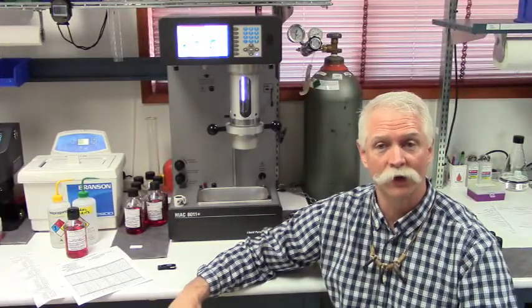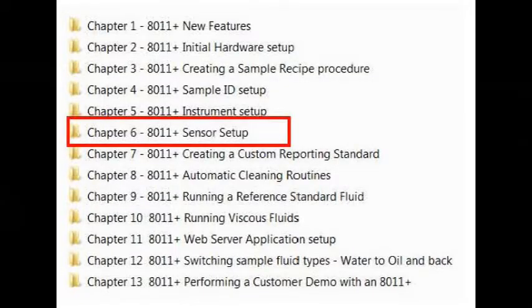So the next thing you're going to do is you're going to set up the sensor and select the proper calibration for the type of testing the customer wants to perform. This is covered in Chapter 6 of the How To video series.